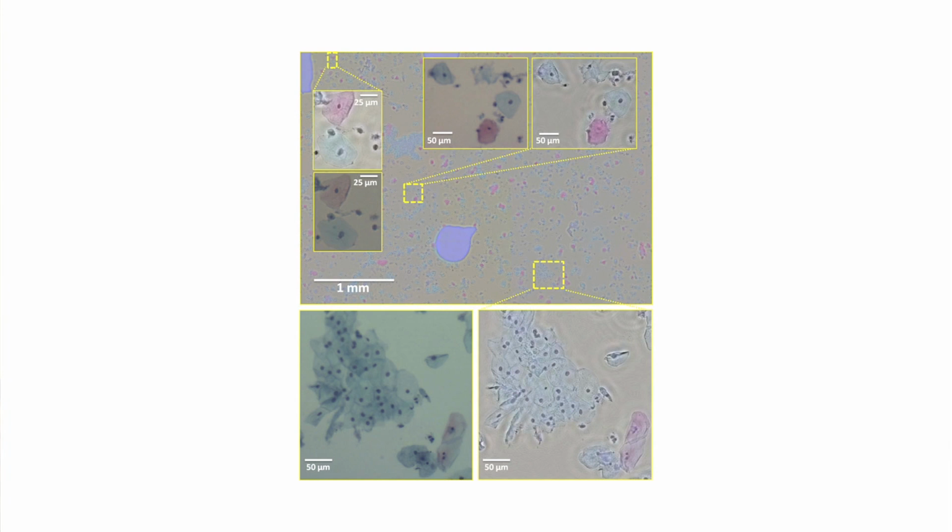In a conventional microscope, whenever you want to go for higher resolution, you immediately sacrifice field of view. There's a trade-off between field of view and resolution. These microscopes break that trade-off because they decouple resolution and field of view. Another way of saying this is a 12 megapixel imager has a certain pitch size, 1.1 micron in this case. It gives us a very large numerical aperture, almost diffraction limited.